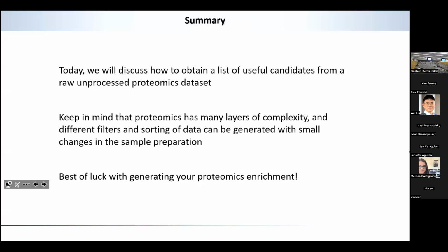These profiles never look as good as you might think. And so it's much harder to tell what the boundaries of my peak are, what is the real intensity of my signal, compared to counting reads. So at the end, you will see that the variability in a proteomic dataset is always higher than in a transcriptomic dataset, mostly because of the nature of how we quantify.